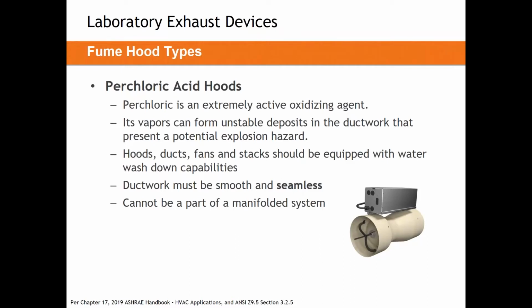So you can see on the right-hand side of the slide here, we show a Kynar-coated Venturi valve. There's a bit of an issue here. The Kynar coating and Teflon coatings on Venturi valves can technically survive a perchloric acid environment. The coating will stand up to that acid.